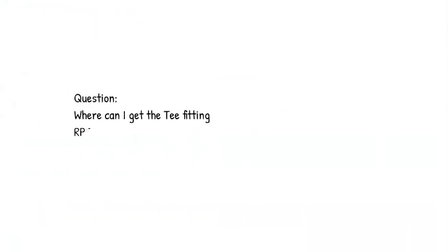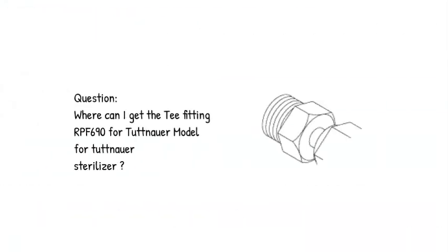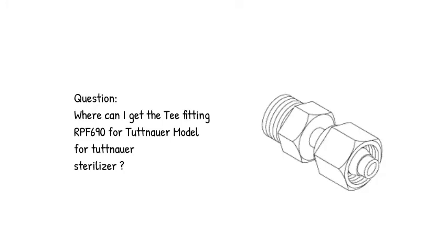Question: Where can I get the T-fitting RPF 690 for Tuttnauer model for Tuttnauer sterilizer?